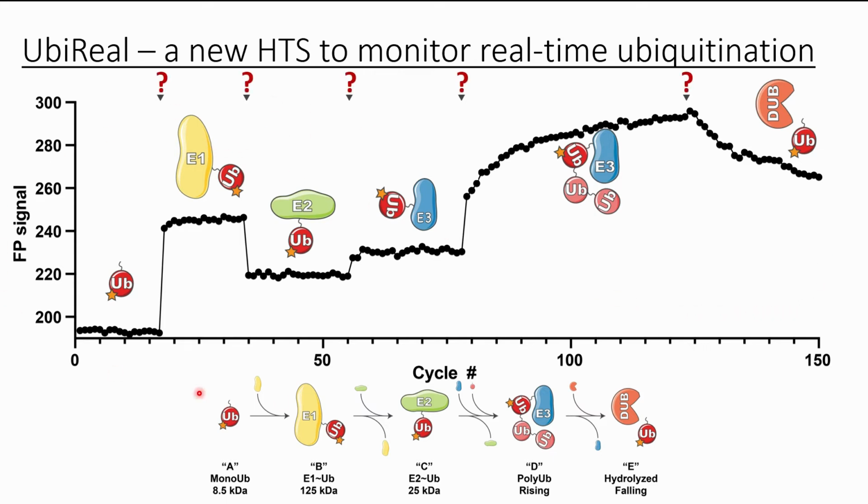So we had built a comprehensive assay, but then we wanted to see along each one of these pathways here, between ubiquitin and the E1 complex, between the E2 ubiquitin complex and the E3 ubiquitin complex, if we could monitor what was exactly going on between here. And for example, maybe be able to see if a drug could target one of these spots, and if the assay could then be used to characterize that drug.